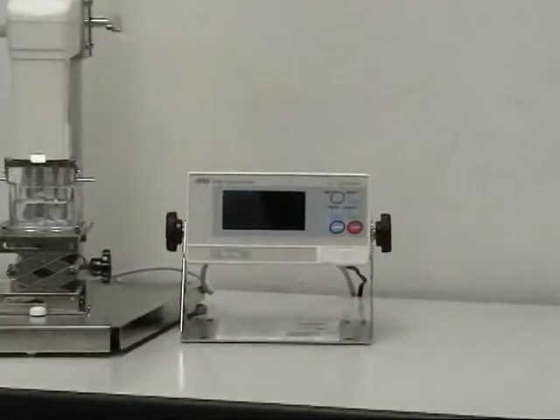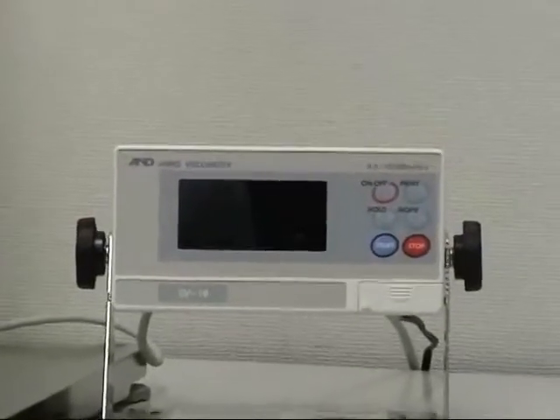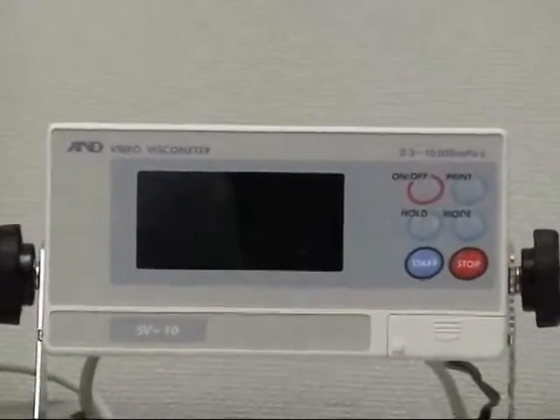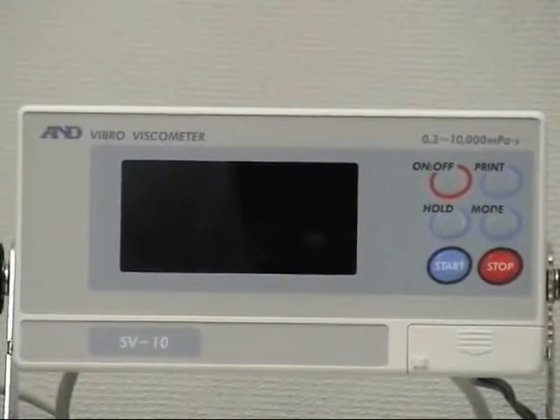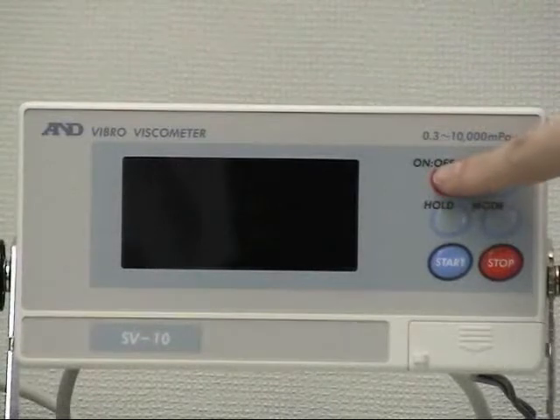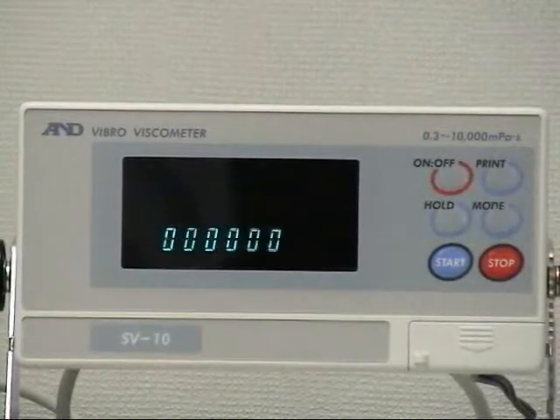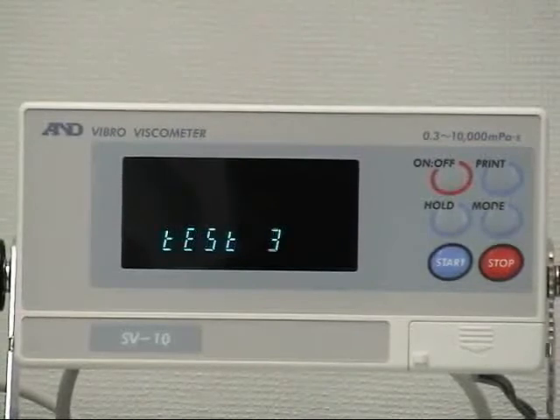The display unit has only 6 keys for simple and easy operation. Press the on-off key for standby mode. The vacuum fluorescent display is very clear and easy to see to prevent reading errors.